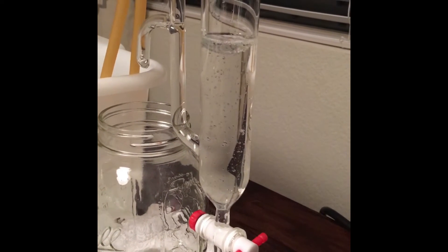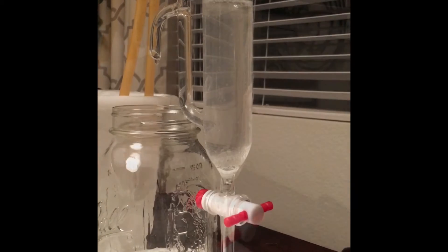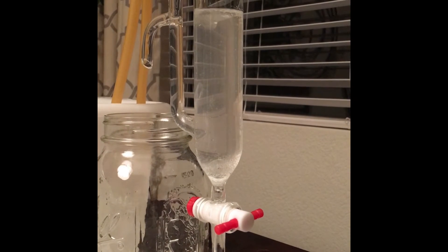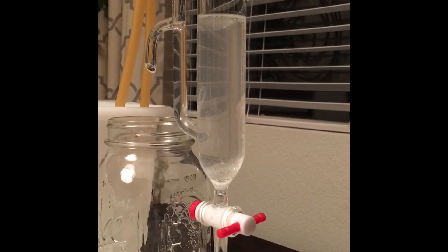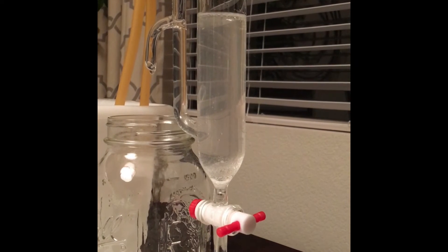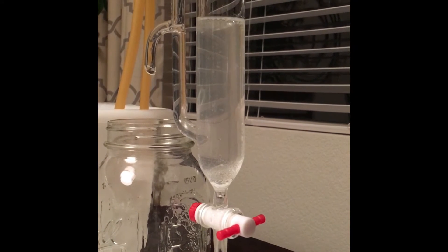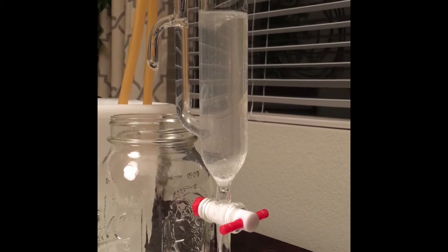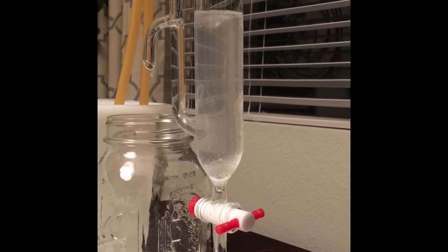We've got the hydrosol and the oil — this is what the separator does. This is about two and a half hours in, and you can see the separator has become very cloudy. A lot of the oil has sunk to the bottom, which means it's heavier than the water, but it hasn't really come together. It looks like condensation, but it's not — it's oil bubbles.